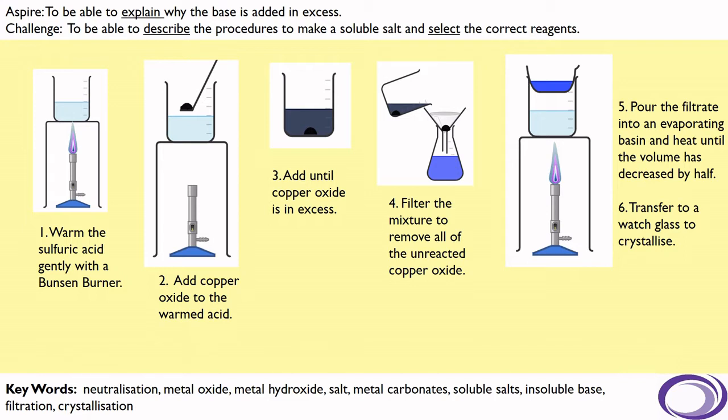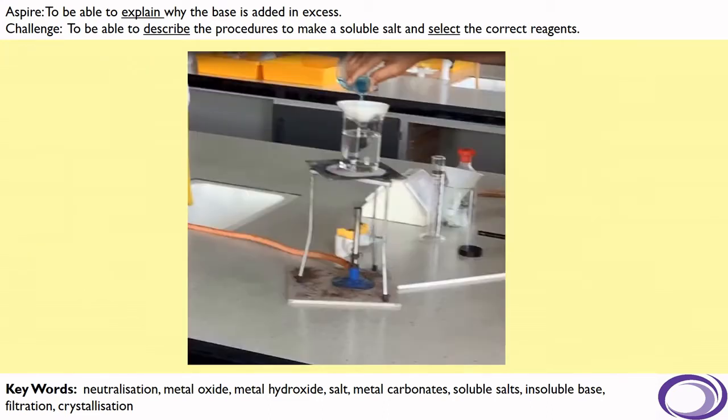If we leave it to cool slower, we will actually get bigger crystals. Now, I'm going to insert a video of my colleague performing this investigation so you can see that method in action.